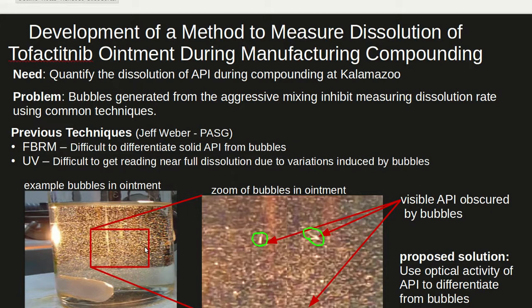Similarly, Jeff Weber of PASG demonstrated that both FBRM and UV also had difficulties measuring the API dissolution rate due to the air bubbles. Therefore, our goal was to develop a new method in which the air bubbles could be screened out and we could get accurate measurement of the API dissolution.